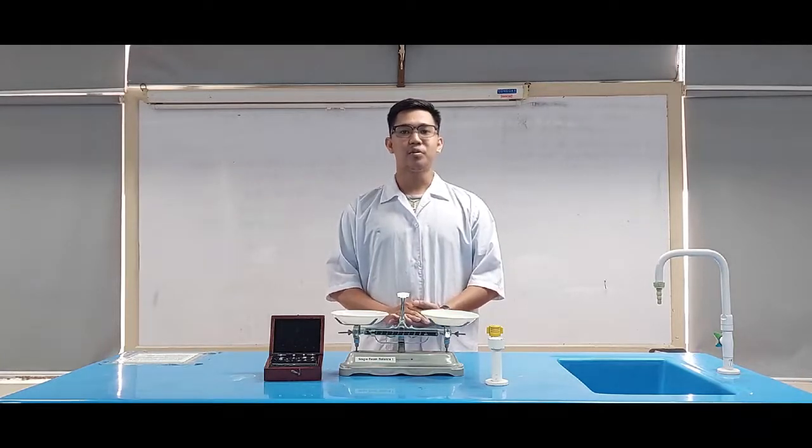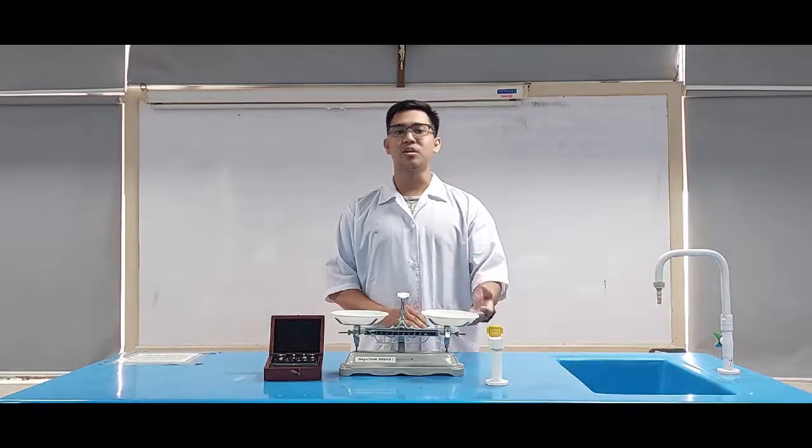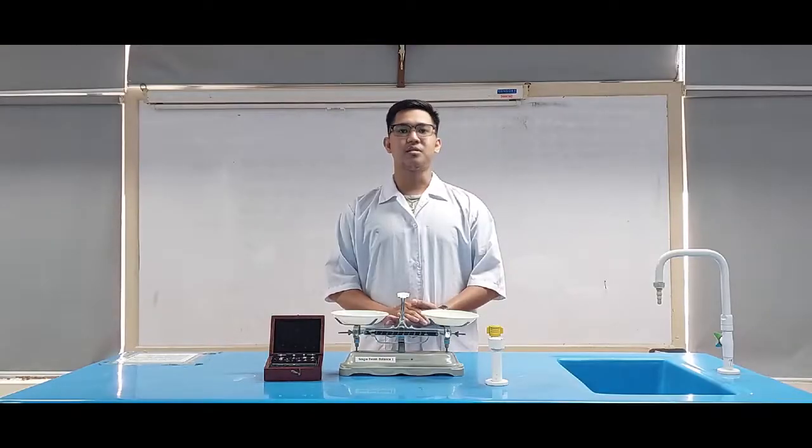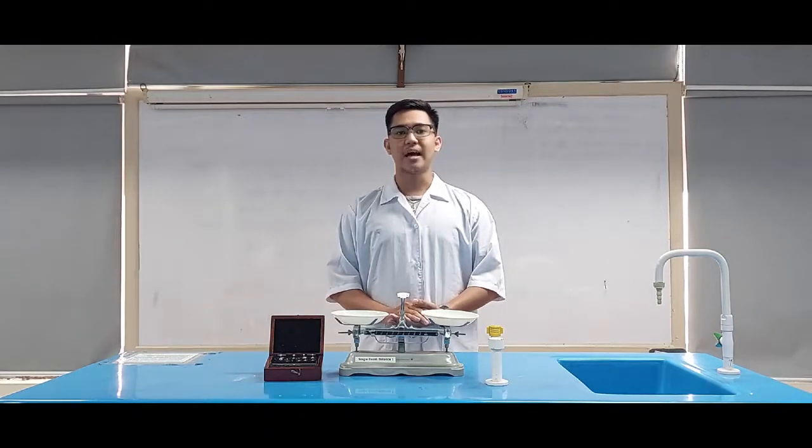Another application for the scale is to place two items on each pan and adjust one side until both pans are leveled. This is convenient in applications such as balancing tubes for centrifugation where two objects must be the exact same weight.